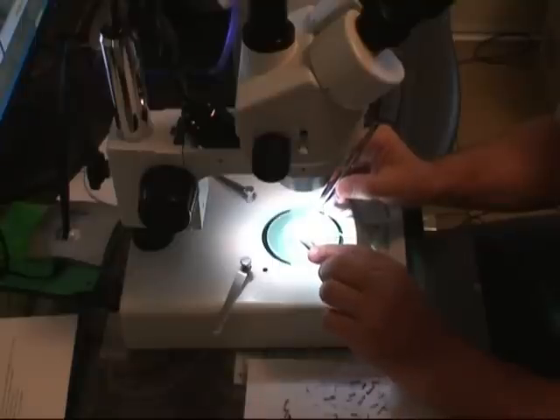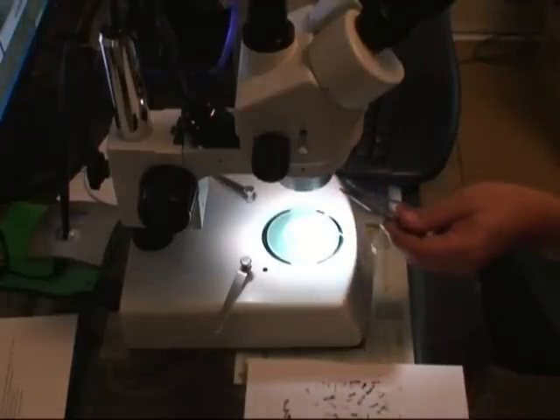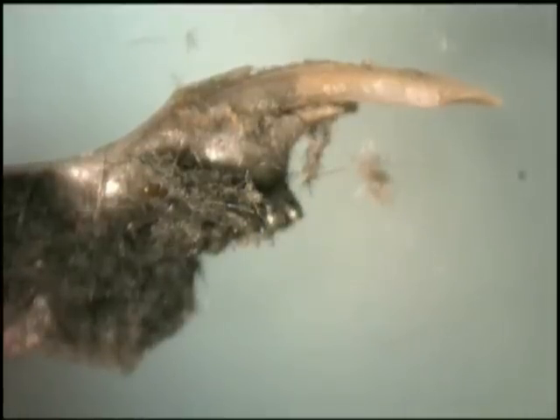Let's take these pieces and have a closer look at them under a dissecting microscope. This piece looks like the jaw of a small rodent, probably the common field mouse. Note all the fur on the bone — it's this fur that makes up the matrix of the pellet.